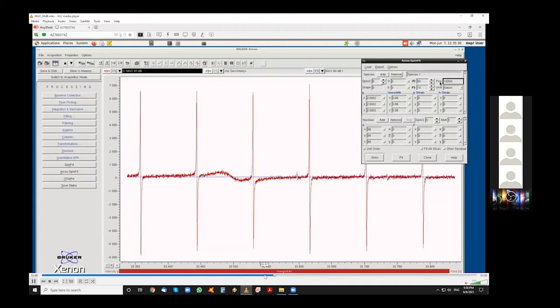let me go back a little bit more. So here in the population window, it's 0. So the program is not doing anything. This could be a very good indicator that we hit a local minimum in the program, and we have to do some drastic changes with one of the parameters to be able to move from that local minimum point. So I will put a number of population here, and I will show you what is happening after.